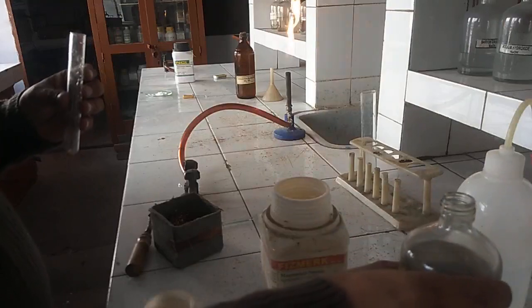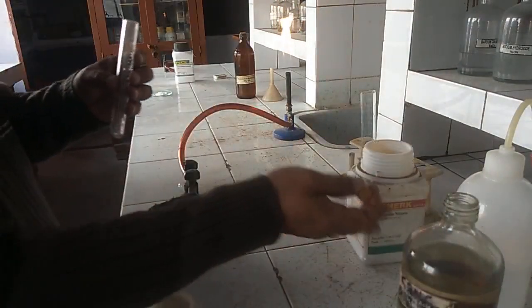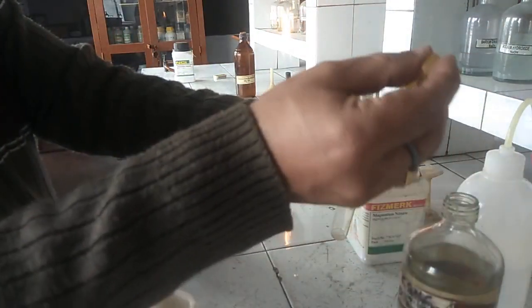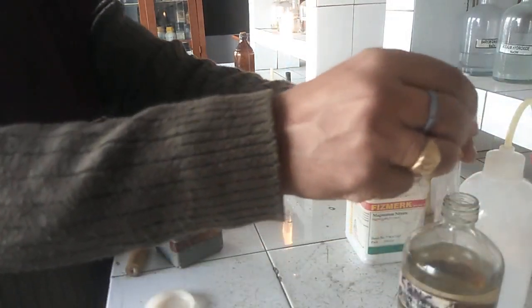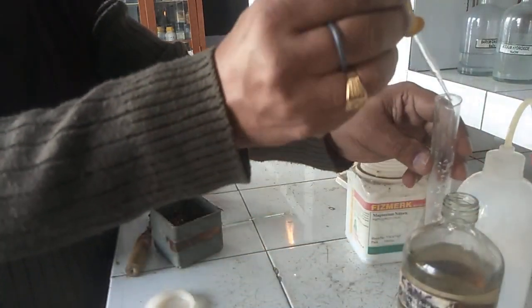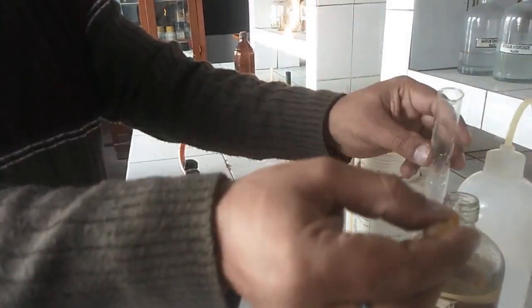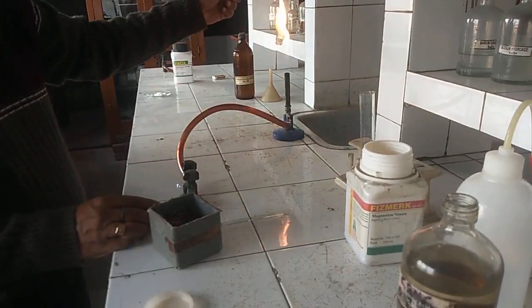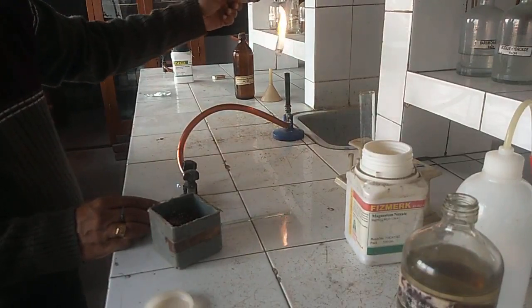Now we will add concentrated sulfuric acid to this. Now we will heat the content of the test tube over the Bunsen burner.